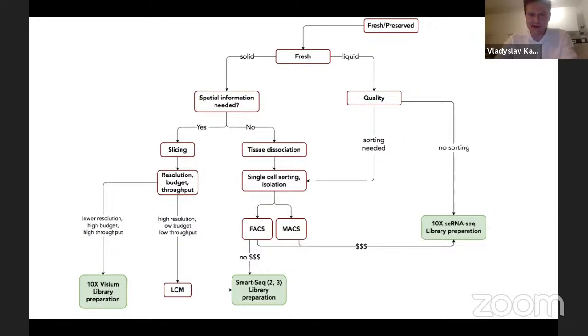So at this point, I would take a look into the chat because you have a lot of questions, and maybe some of them are better discussed here. The first one is: does staining affect cell behavior, and does it impact reproducibility among different cell types? The staining can interfere with your messenger RNA quality a lot.